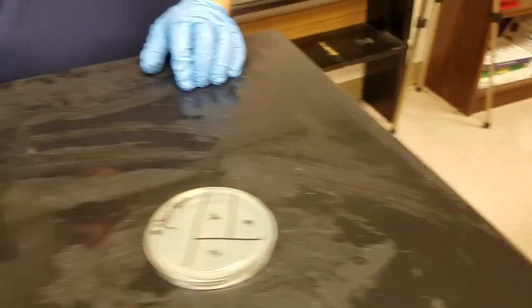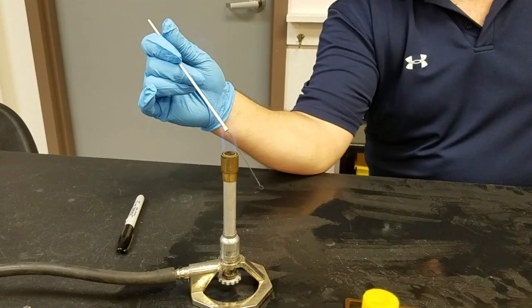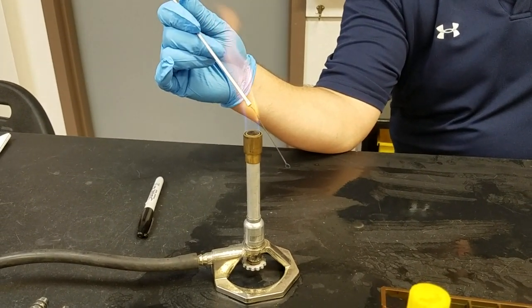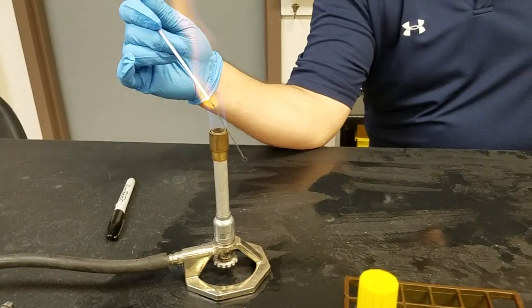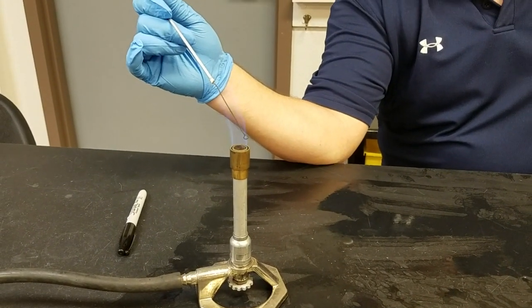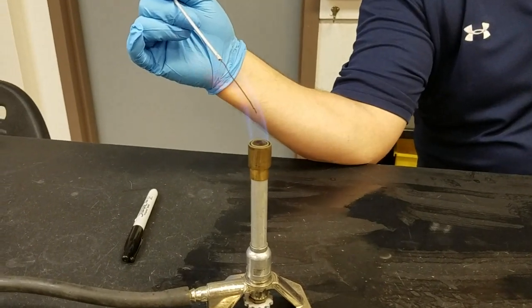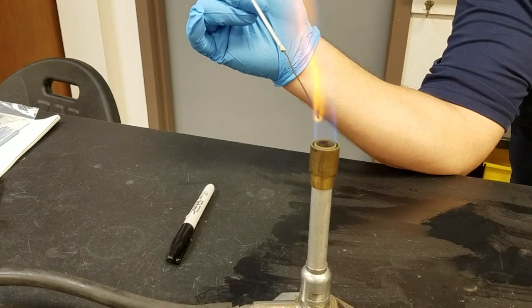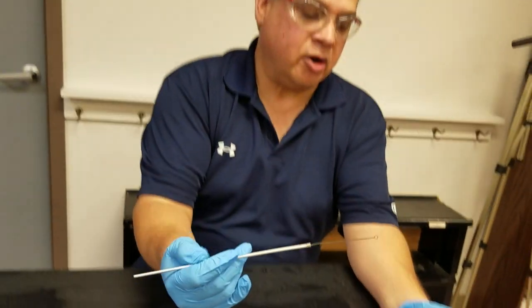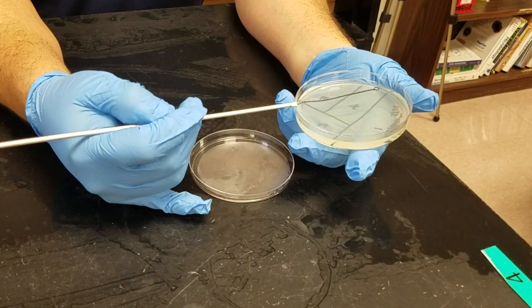Put that down, come back and flame the loop because remember, I'm not interested in the population on that loop - I'm only interested in the population that has been streaked on that first quadrant. So I'm going to flame this loop completely, get it really nice and orange and hot. It's hot, so I'm going to touch it to that area in the fourth quadrant to cool it down a bit.